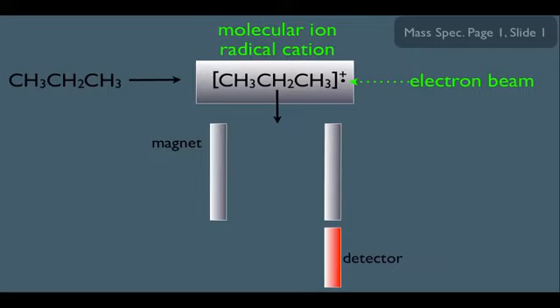It detects substances. Now, without getting crazy with all the physics here, you're just going to have to accept my word for it. When you move a charged particle through a magnet, it takes on a curved path. So our particle is going to curve like this. And it's going to hit the detector at a certain location. And wherever it lands, that enables the detector to measure the radius of that curve.